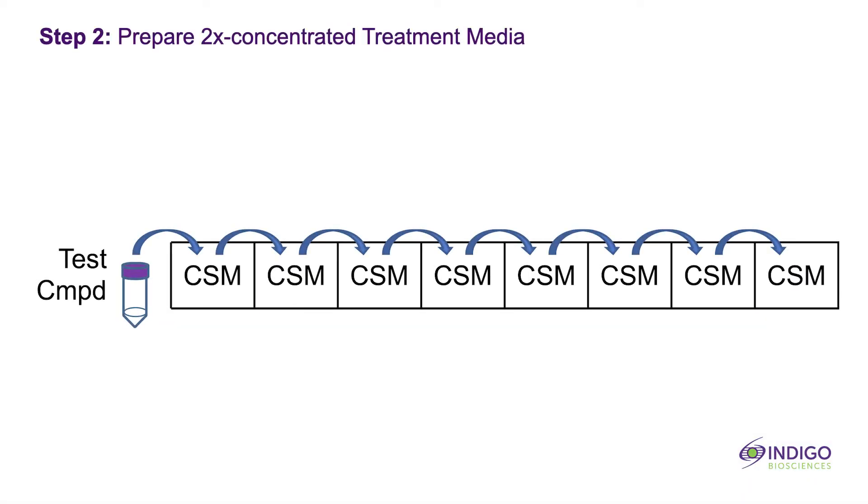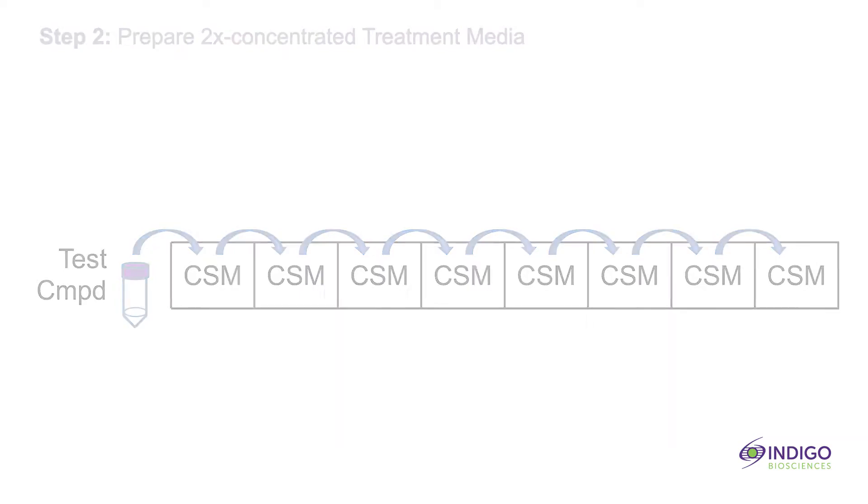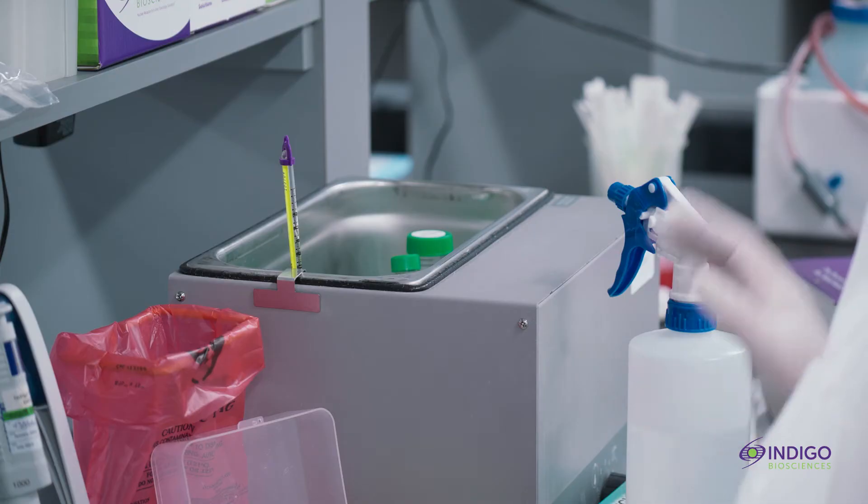Use the thawed compound screening medium to prepare the various test compound and reference compound treatment media that will be applied to the reporter cells. Note that all treatment media are prepared at two times concentrations relative to their respective final assay concentrations. Put these prepared treatment media aside while you next prepare the suspension of reporter cells.